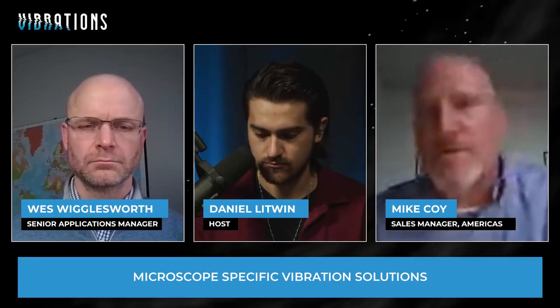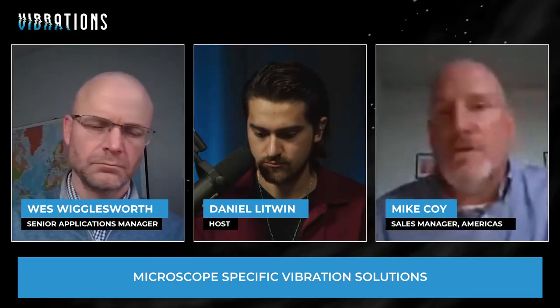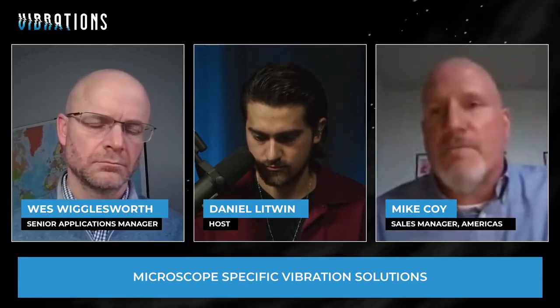As these microscopes get better and better in performance, as more applications develop, unfortunately, what we're seeing is more microscopes being put into less ideal situations. People try to put a high-res TEM on a second floor in a building, for example, which obviously is not ideal, but fortunately, quite often we can deal with it with the right vibration solution. So it really does come down to a partnership. The microscope people understand vibration pretty well. Obviously, when they feel like they're over their heads, they certainly come to us, and we can come in and talk directly to the customer.